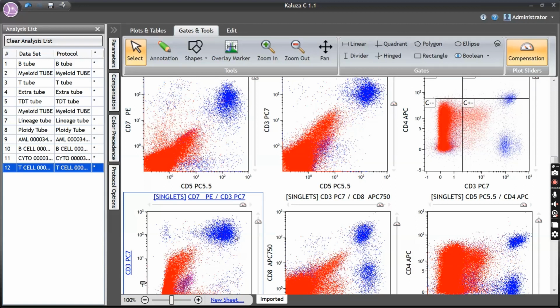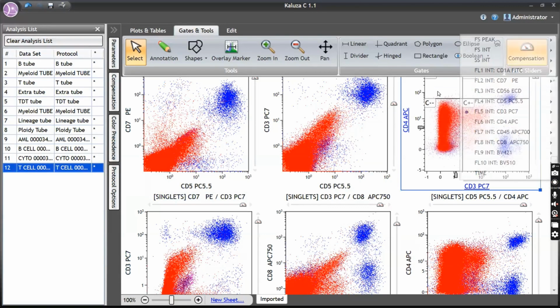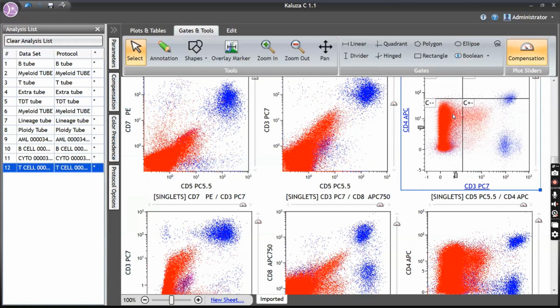But still, I wouldn't stop with these markers. I would do more markers. CD36, I would definitely include. I would include CD22. I would include all the monocytic markers, to make sure I'm not missing anything. Before I sign it out as B-ALL with aberrant myeloid markers, I would rule out all the monocytic markers before declaring the report. But this is interesting. Nice case.